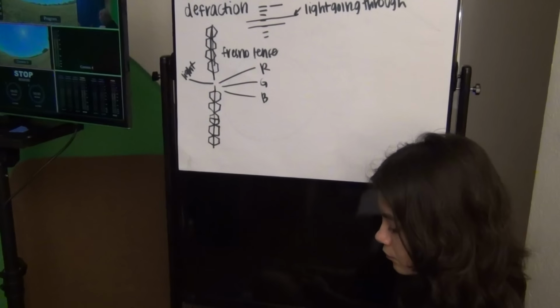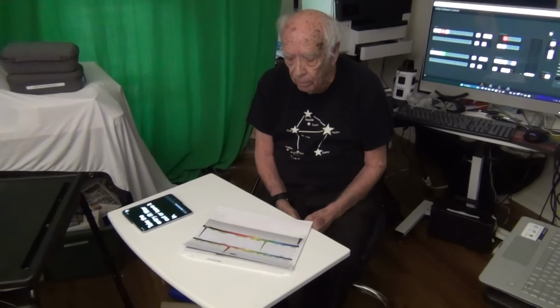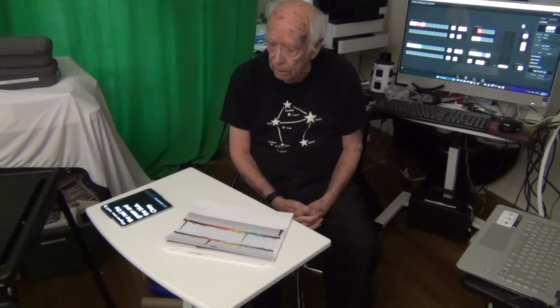So now what we can do is take a webcam, take the IR filter out or leave it in. It doesn't really matter a whole lot depending on what you want to do. And we can separate out the red, the green, and the blue. Okay? And this allows us to do certain things.